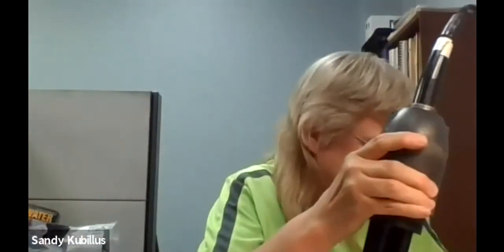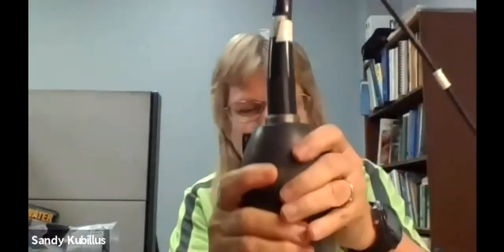And then I have a multi-probe meter. This is called a Quanta, and it measures dissolved oxygen, temperature, and pH. And a little bit faster than using the test kit. And I had a little bit of a mix up there. Okay, so you just would put this into the water sample and you could measure those parameters fairly quickly.